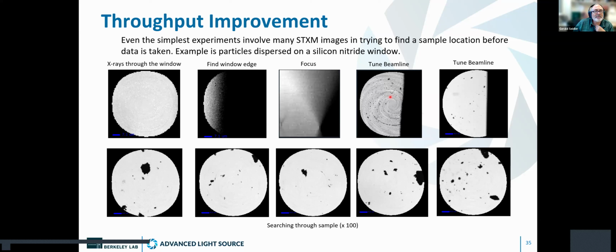Okay, we have a question from Bianca. Yes, hey, about your speed up and the overview that you can get, why do you need to do so many scans? Is the reason why big coarse scans are not possible due to your zone plate scanning, or is there some other reason? Because that would potentially also help if you could get just one big coarse scan.